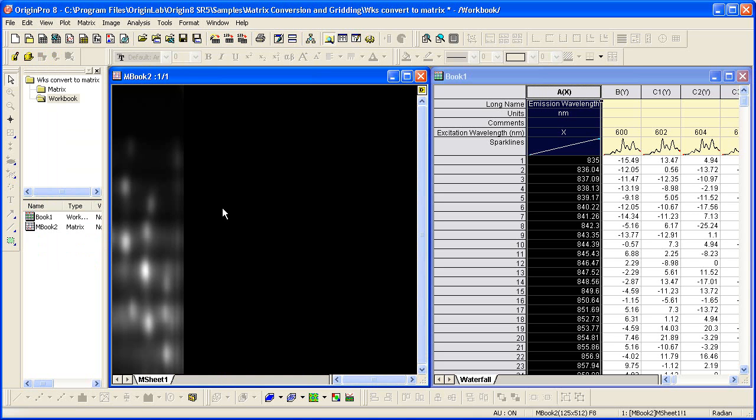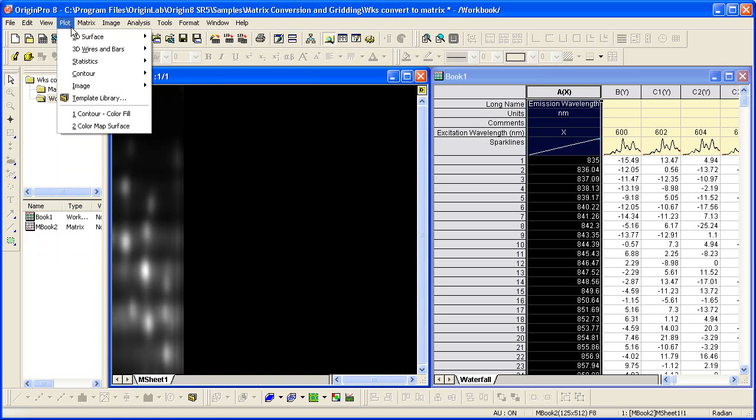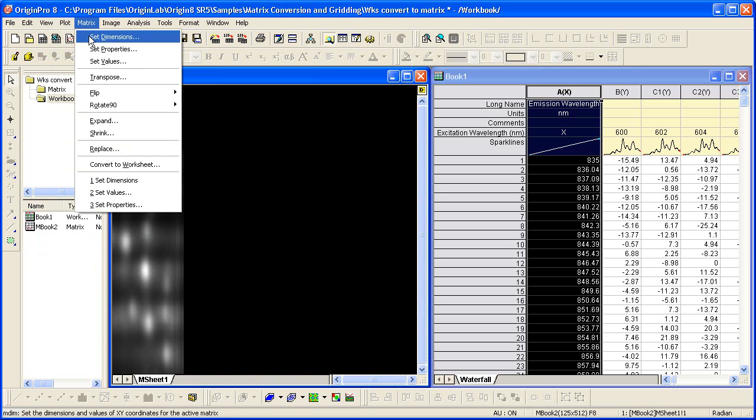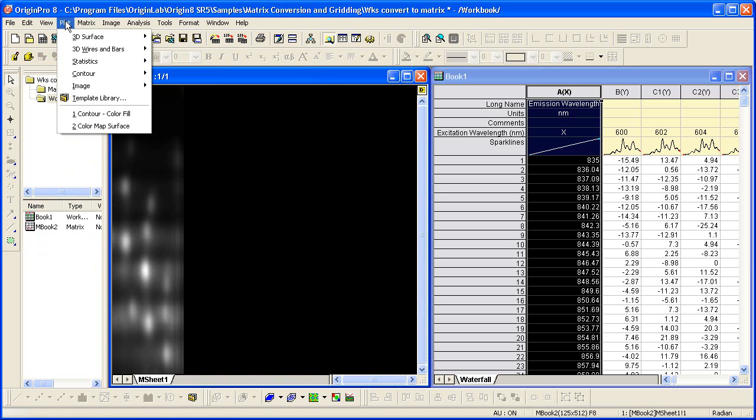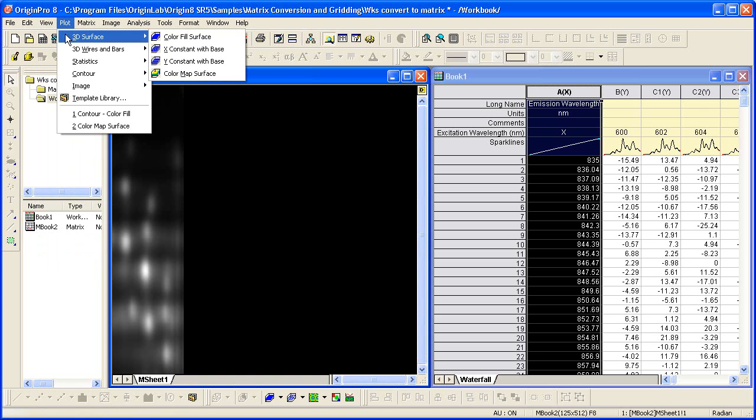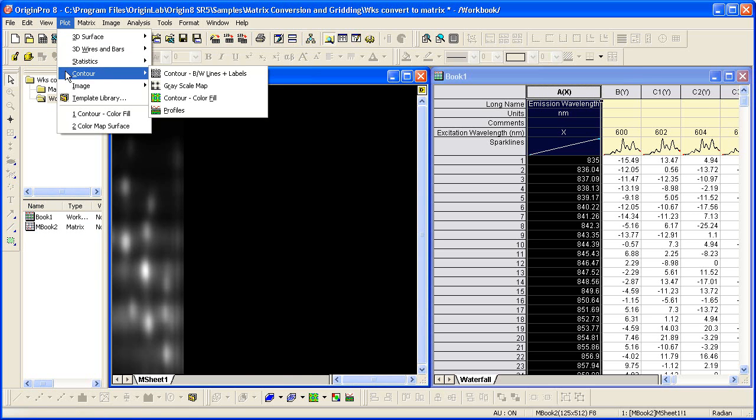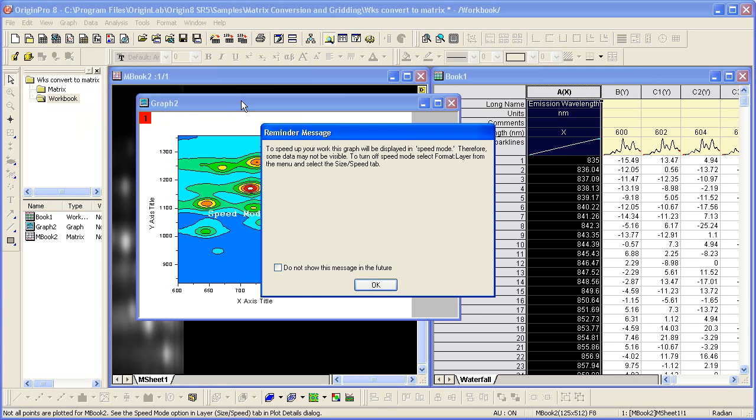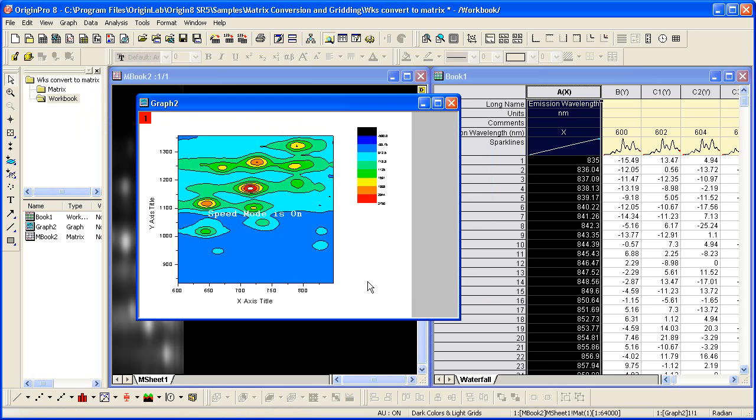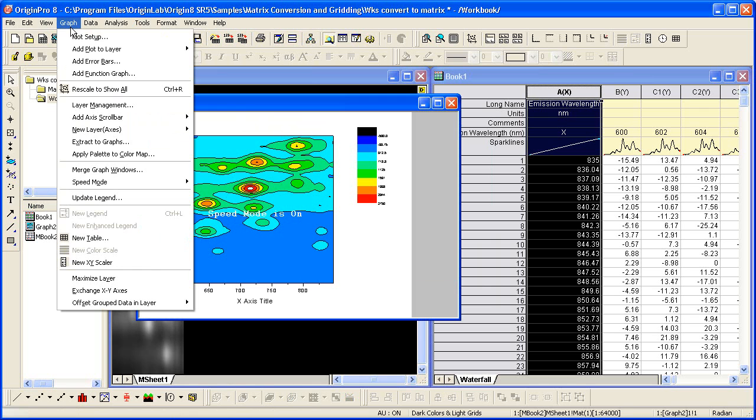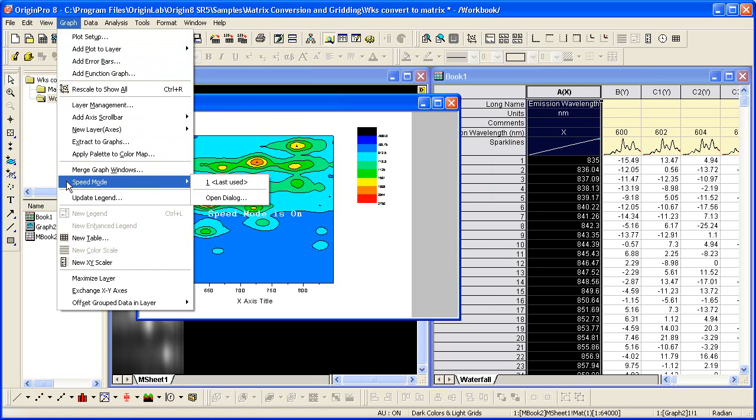To create a 3D plot from our matrix, we simply select the plot menu. The 3D surface plots are available, as well as contour plots. Let's go ahead and do a contour color fill. The reminder message is telling us about speed mode. From the graph menu, I can turn speed mode off to display all the points.